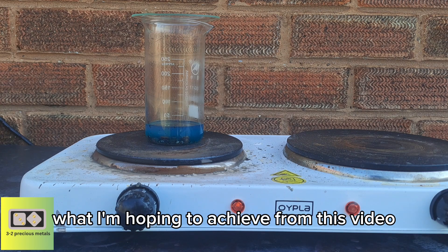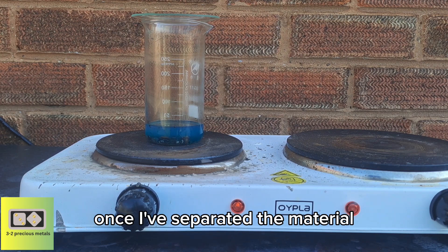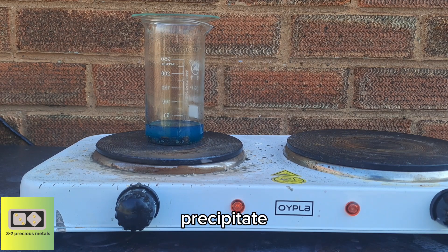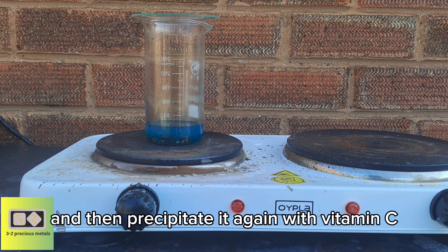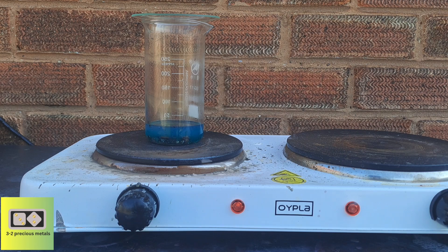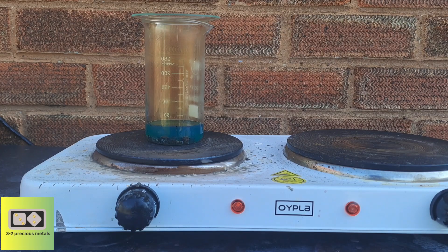What I'm hoping to achieve from this video is a new way of dealing with silver chloride. So once I've separated the material, my plan is to precipitate silver chloride with some hydrochloric acid, dissolve the silver chloride in ammonia, and then precipitate it again with vitamin C. But first we have to get the material separated, hence why it's sitting in nitric acid.